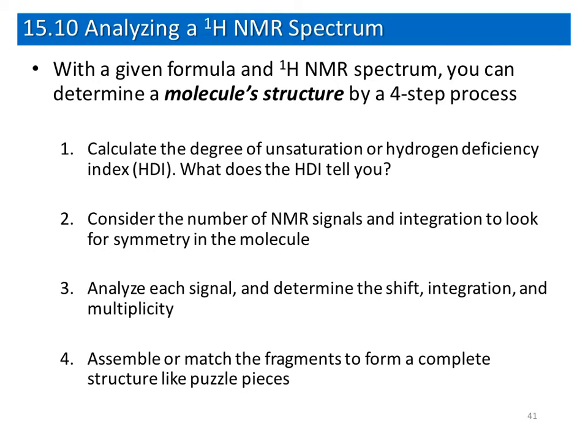So we talked about IR, hydrogen NMR, and carbon NMR. Now we are going to use these techniques that we learned about to determine the structure of molecules. In order to do that, there are 4 steps that we need to follow. In most spectroscopy problems, the molecular formula is given.